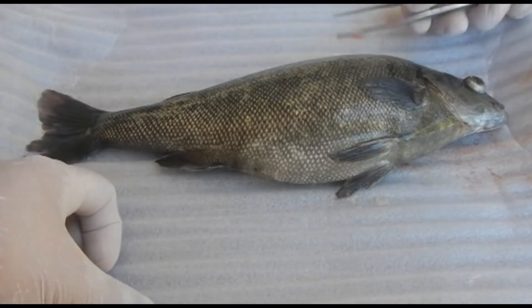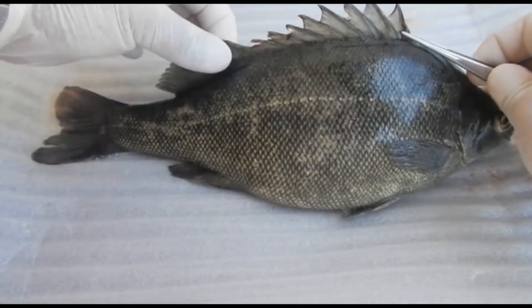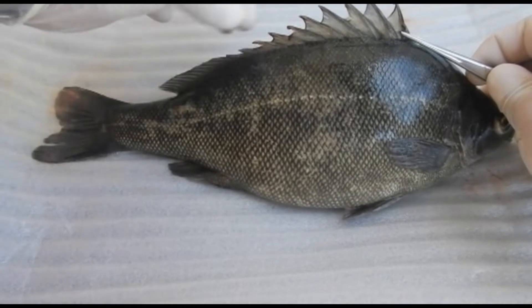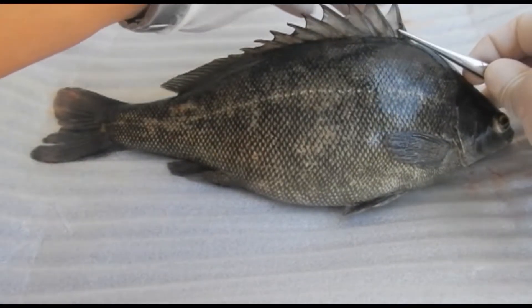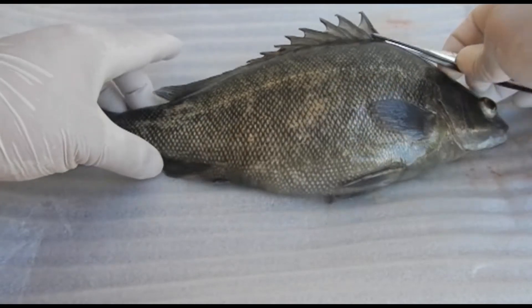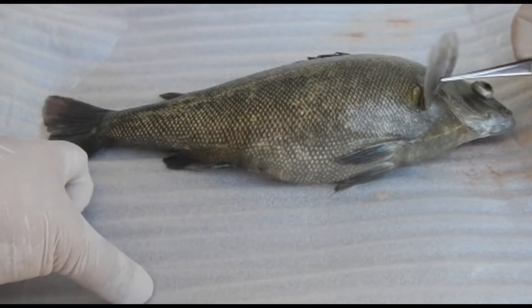Now we'll start talking about the fins. Here I'm showing you the dorsal fin, and you can notice this fish has only a single dorsal fin — some fish have two. Notice the dorsal fin has got spinous processes, so you've got to be very careful when you handle it. The dorsal fin is used for steering.